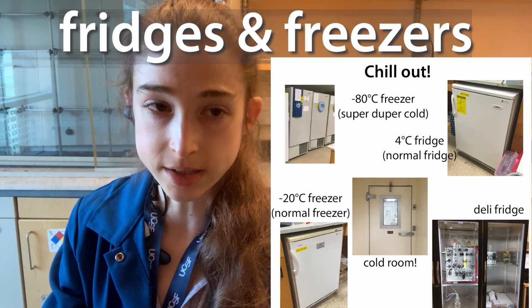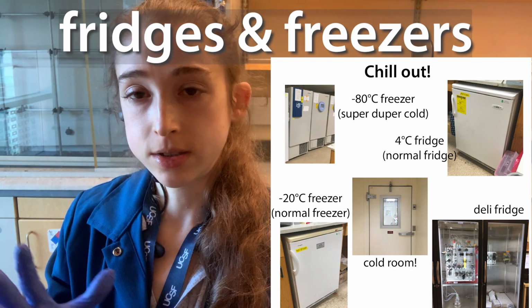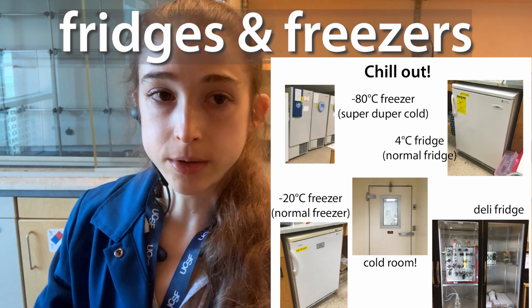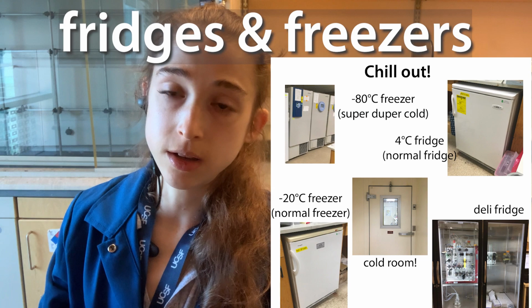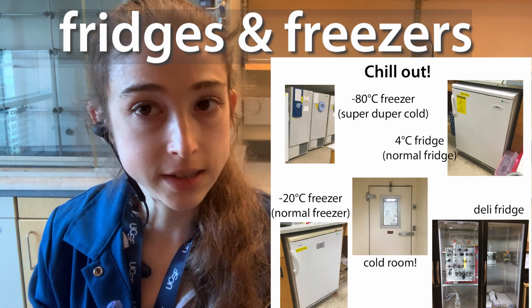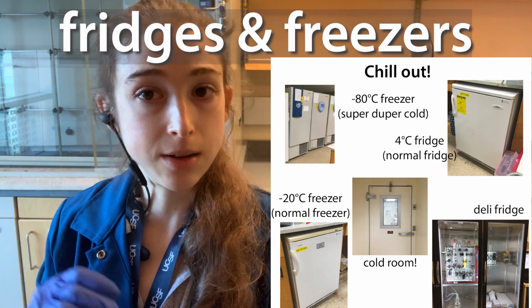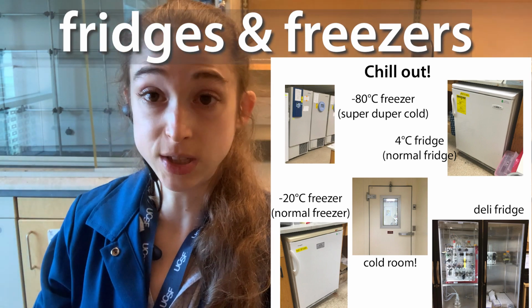These are about 4 degrees Celsius. So you can see it's slightly above the freezing point of water, so we're not freezing things, but we're just keeping them nice and cold. And we also have freezers, so your normal freezer is going to be about minus 20 degrees Celsius. If you see minus 20, that's just one of those normal freezers. You see minus 80, well, now that's one of our special freezers, which gets really, really cold.